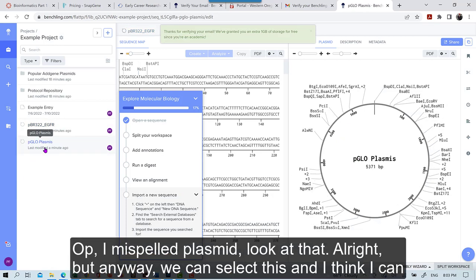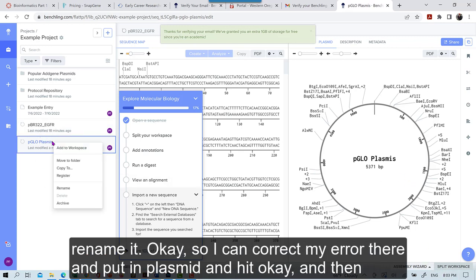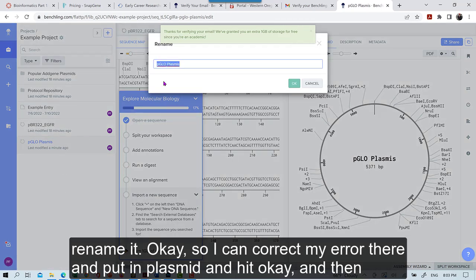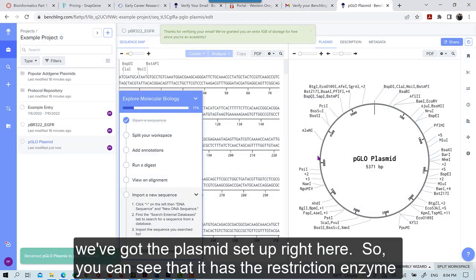Oh, I misspelled plasmid. Look at that. Alright. But anyway, we can select this and I think I can rename it. So I can correct my error there and put in plasmid. Hit OK. And then we've got the plasmid set up right here.